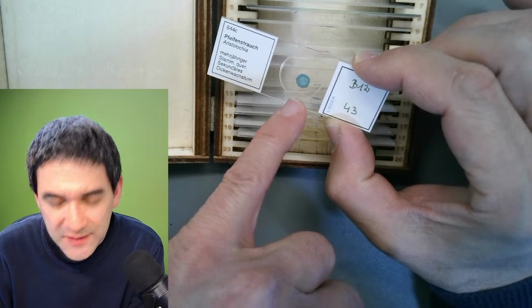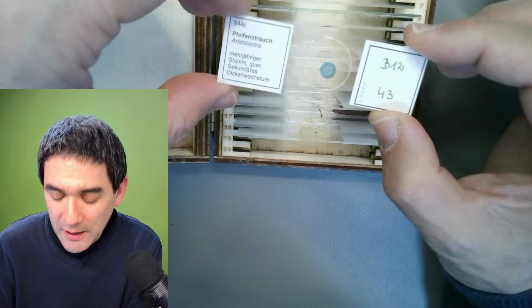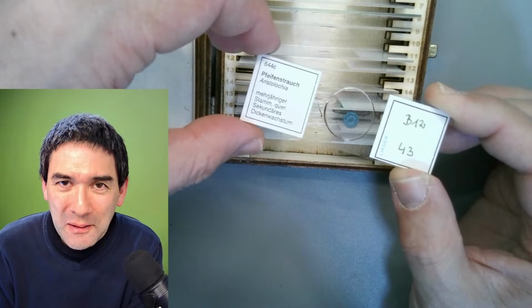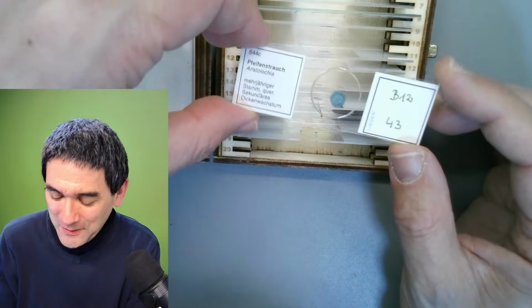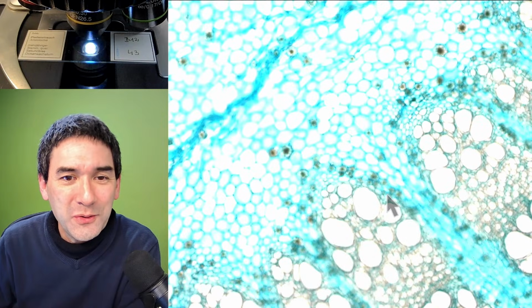It's about 5, 6, 7 millimeters across. This was one of my first slides, where I took, I kid you not, a few hundred overlapping pictures of this using my homemade webcam microscope camera. Then I manually stitched them together at that time into a larger image. I just want to show it to you because I think it's pretty nice looking, and that's why I chose this one.